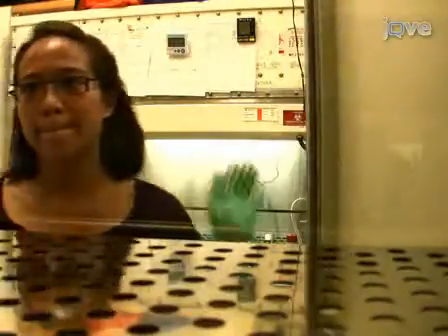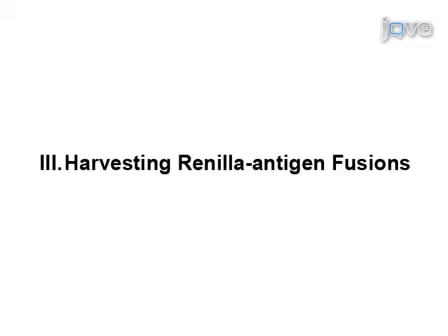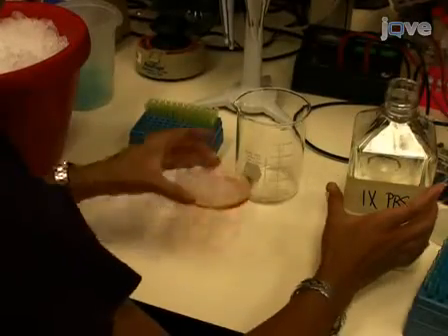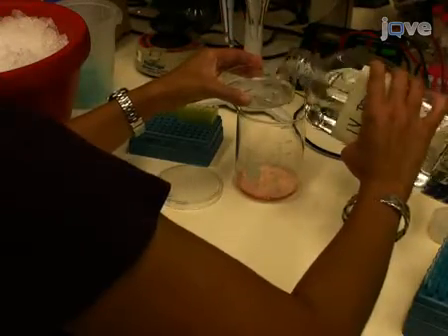Incubate transfected COS1 cells for 2 days, then harvest. To begin harvesting fusion protein, remove media and wash the cells with 6 mL of PBS.